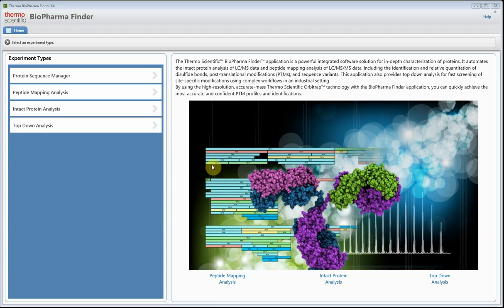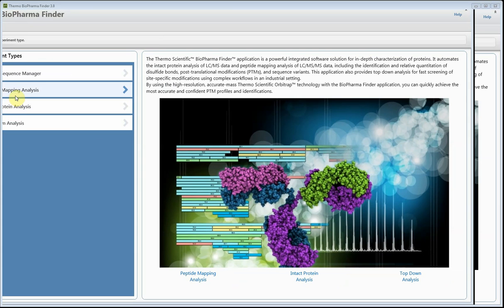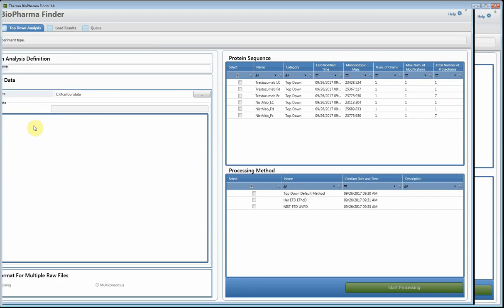Hello and welcome to the BioPharma Finder training video. In this video I'm going to show you our new workflow for top-down analysis. On the screen you'll see the BioPharma Finder 3.0 software, which has the peptide mapping workflow, intact analysis workflow, and now a top-down analysis workflow.